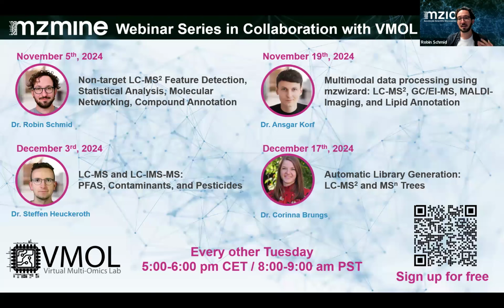Then Ansgar is going to take over in 2 weeks. So you're going to have those seminars every 2 weeks, with multimodal data processing: mass spectrometry, but then with LC-MS, GC, electron impact mass spectrometry, mass spectrometry imaging, and also other compound classes like lipid annotations. So kind of broadening the technological scope.